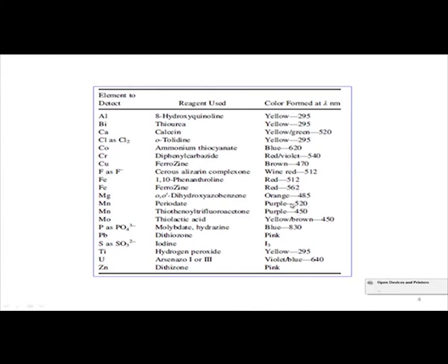The next day we will consider how, in a solution containing permanganate ion, or dichromate ion coming from chromium, we can detect them with the help of a spectrometer, by the use of absorption spectrophotometry. Okay. Thank you very much.